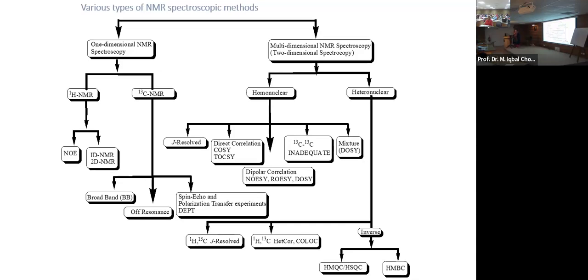If you have a small molecule like ethanol, with only 2 carbons, a very small quantity is fine. The analysis depends on how big your molecule is.